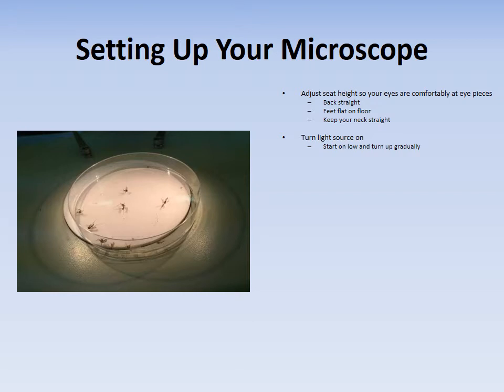It's going to save the light bulb. Some of these light bulbs are expensive, and it's going to save them so you don't have to replace them more often.